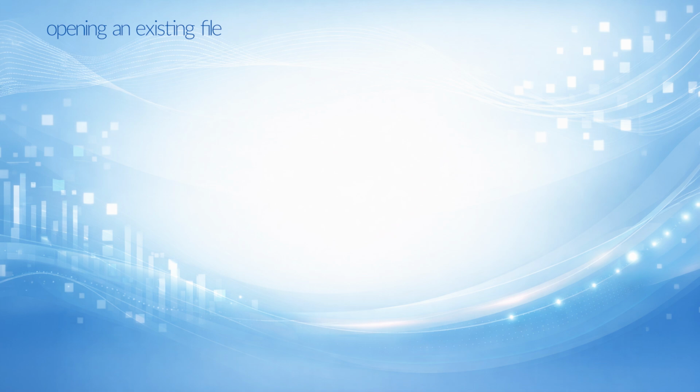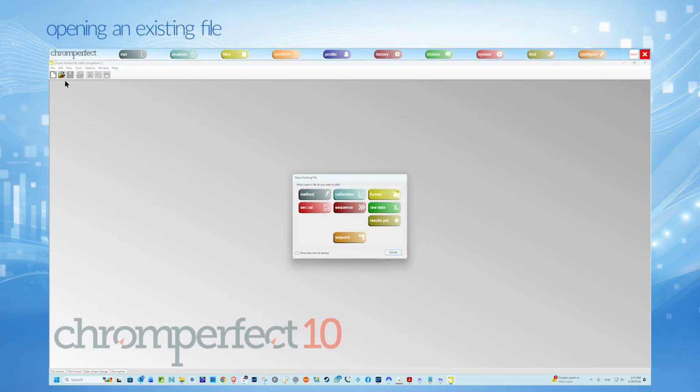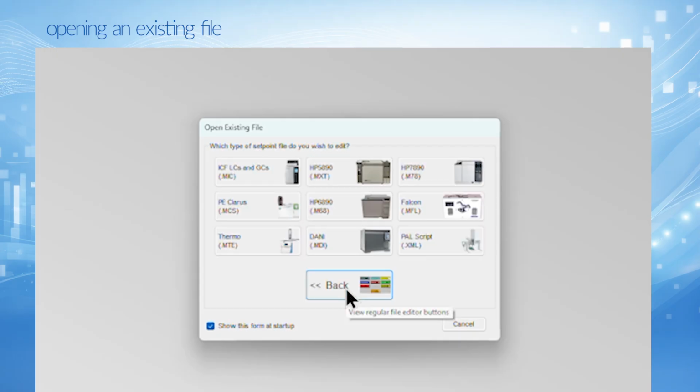Opening an existing file. To open an existing file, choose File, Open. The Open File dialog appears, as you can see here. Except for a checkbox, this dialog is identical to the New File dialog. If the checkbox is selected, this dialog will appear automatically whenever the file editor is launched. Press the Setpoint button to view additional file types and press the Back button to return to the main layout.